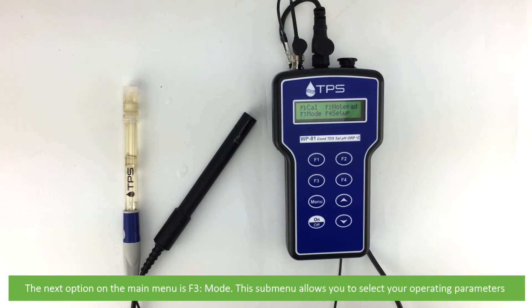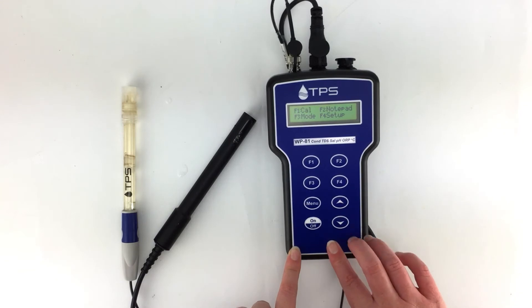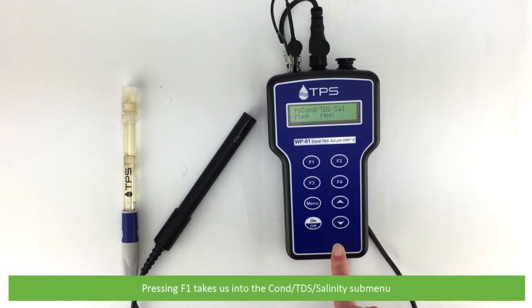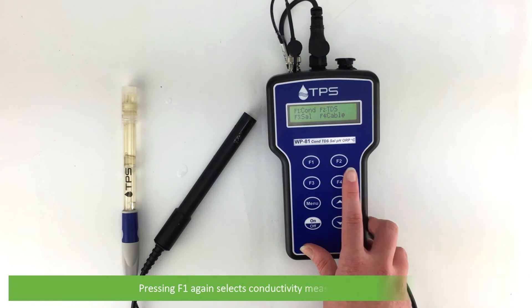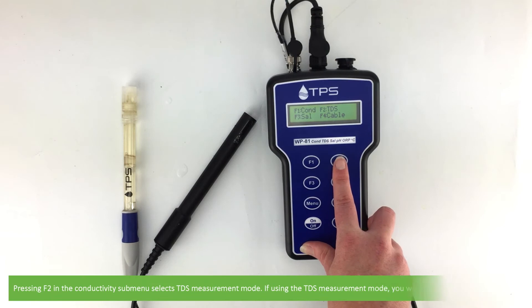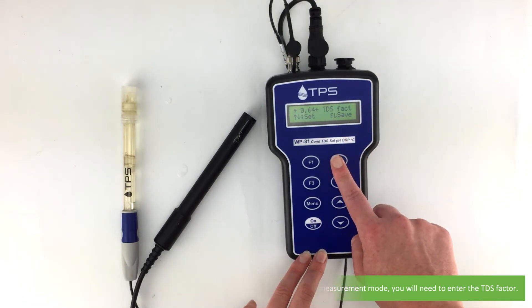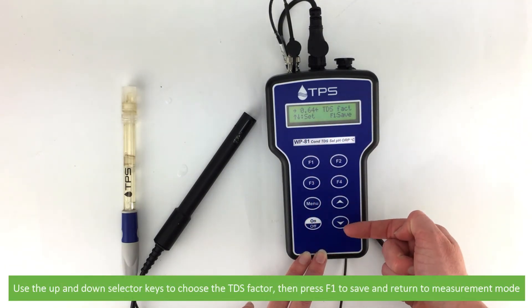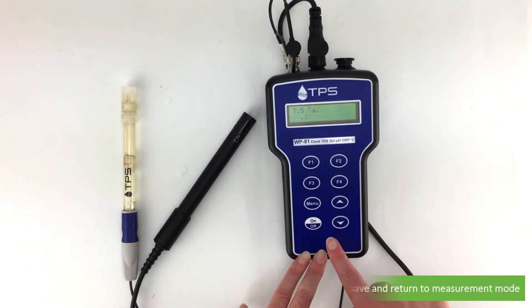The next option on the main menu is F3 mode. This submenu allows you to select your operating parameters. Pressing F1 takes us to the conductivity, TDS, salinity submenu. Pressing F1 again in this menu selects conductivity measurement mode. Pressing F2 in this conductivity submenu selects TDS measurement mode. If using TDS measurement mode, you will need to enter a TDS factor. Use the up and down selector keys to choose the TDS factor, then press F1 to save and return to measurement mode.